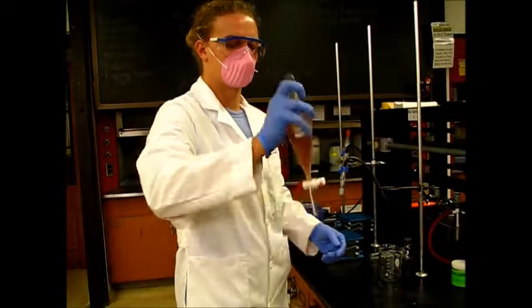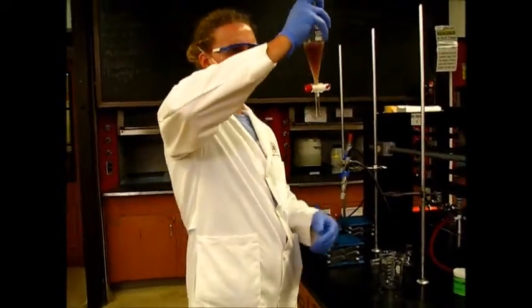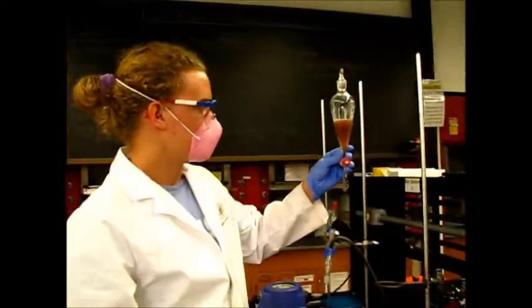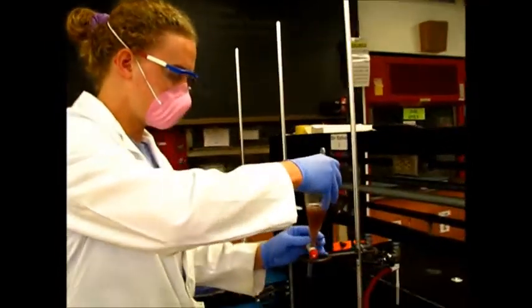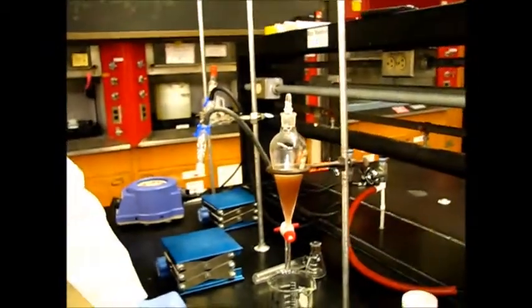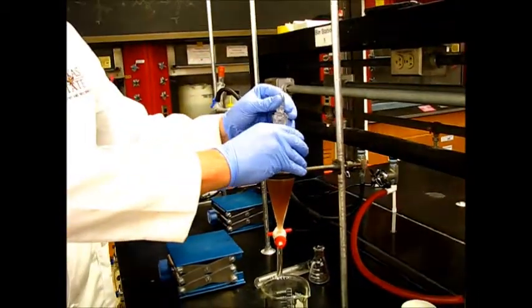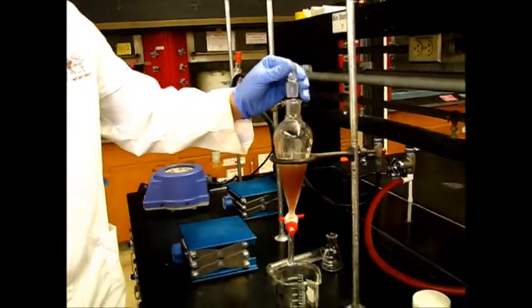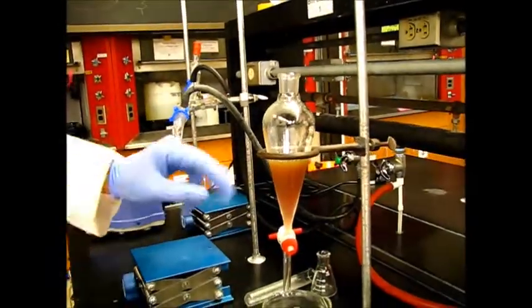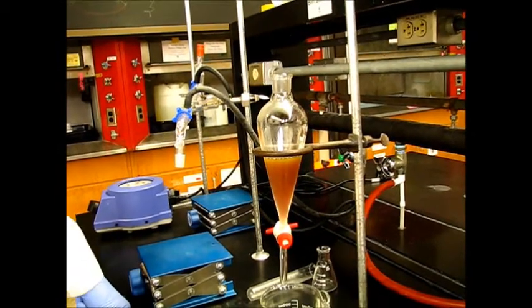This step shouldn't have too much gas being created. Separate back out. So the top layer is going to be our product, the isopentyl acetate. The bottom layer is going to be water and some sulfuric acid.